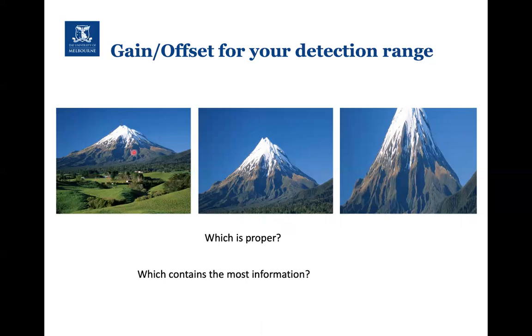This one of the 3 is probably the best because you can see the top and you can also see a little bit more context as to what's happening at the lower level. It'd be great if you could have an image that had the top of the mountain and then all the way down to sea level, and that sea level is your kind of baseline in terms of the height. So of these 3, this is probably the best of the 3.